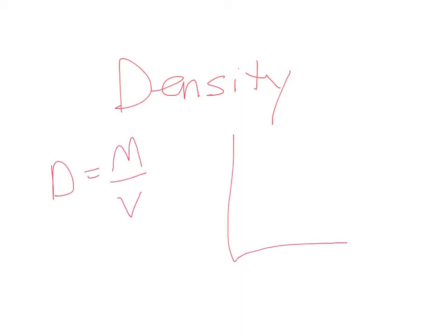In this lab, we found the density of a solid 2 different ways. First, we did it using single points, using the equation density equals mass over volume. We also found it using a graph, mass over volume, and we found the slope of the line. We were then able to take our calculated density and look up densities of different materials and determine its identity.